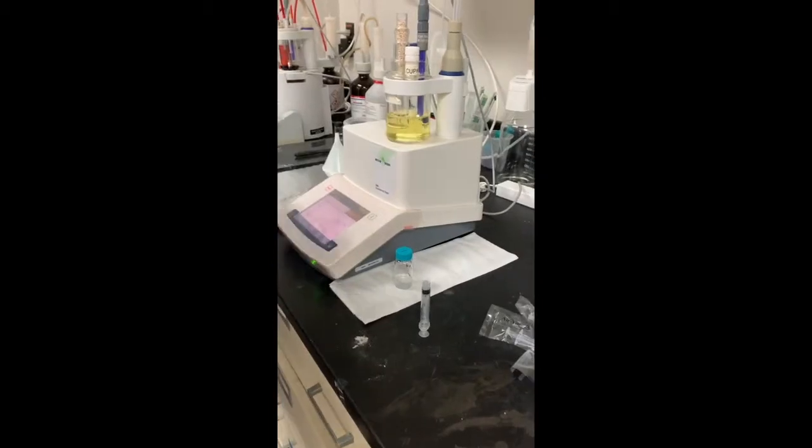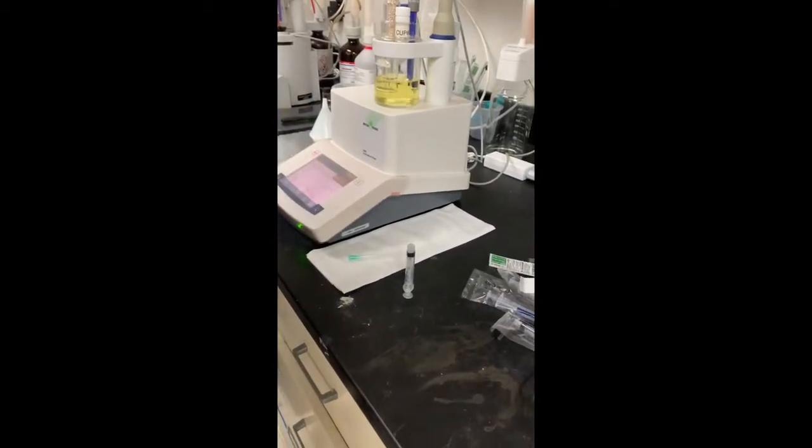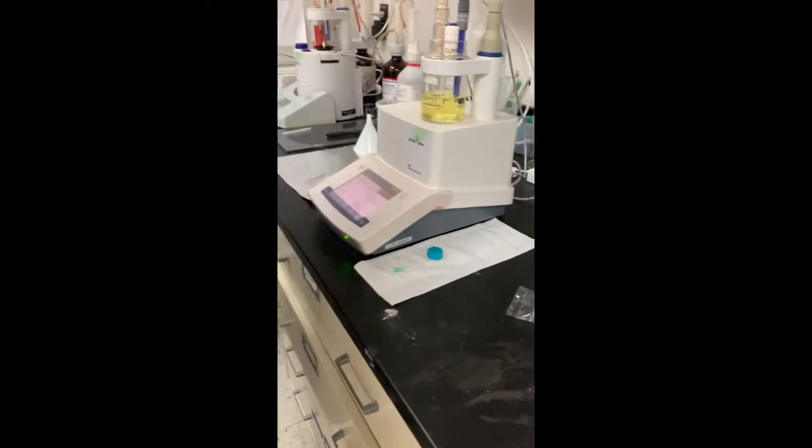The Carl Fischer instrument is used to determine water content. Samples are measured three times to determine the accuracy of the measurements.